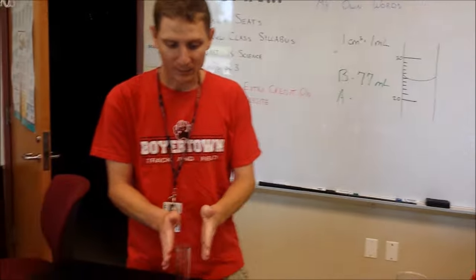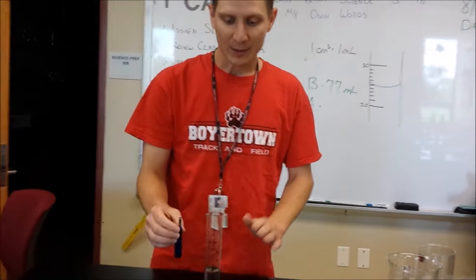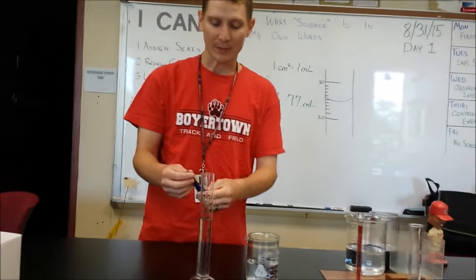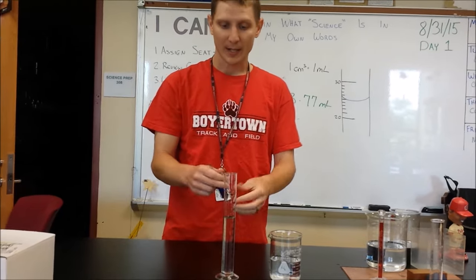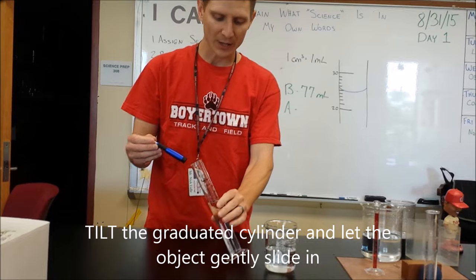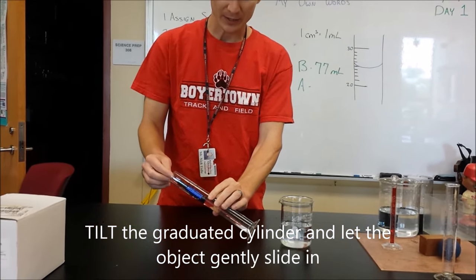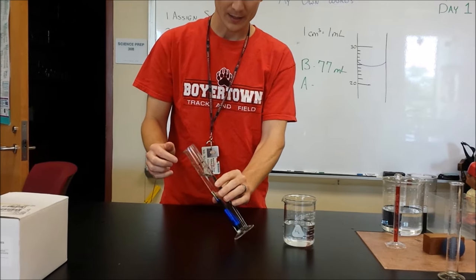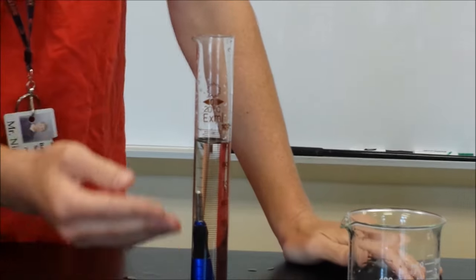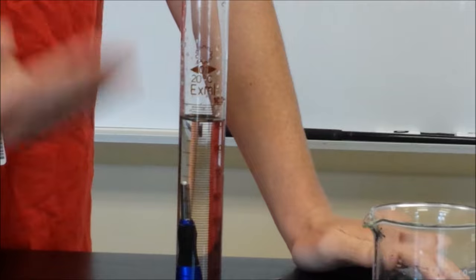All right, so now we're ready to place our object into our graduated cylinder. When we place our object in the graduated cylinder, we don't just want to drop it in, because it's going to splash, or if you have a very dense object that's very hard, it could shatter your graduated cylinder. So we're going to turn our graduated cylinder on its side, place the object in, and just let it slide down to the bottom. You'll notice that our water level went up, that the water level was, we say, displaced by our object.